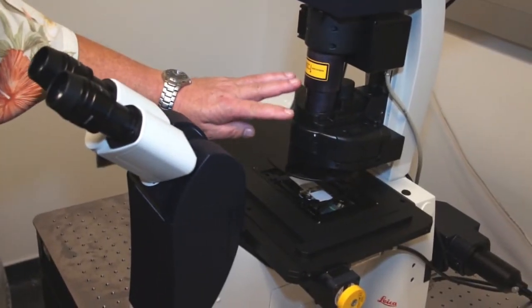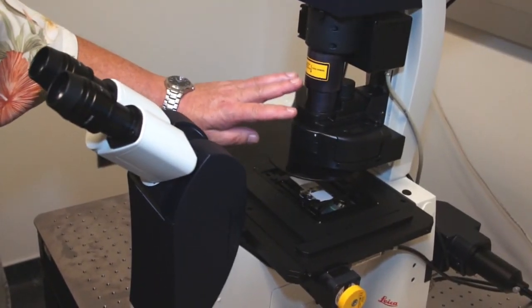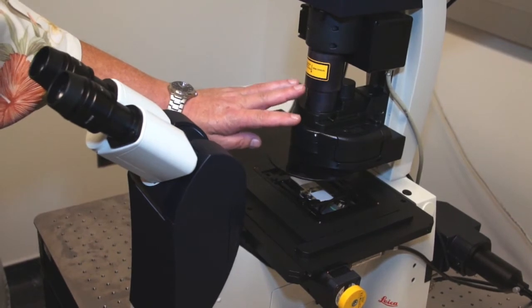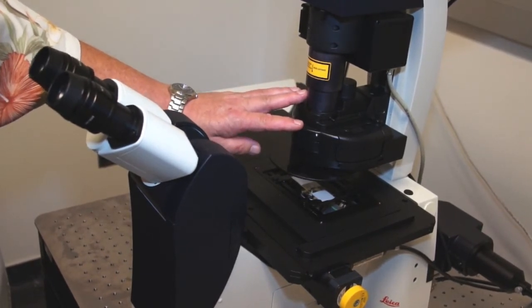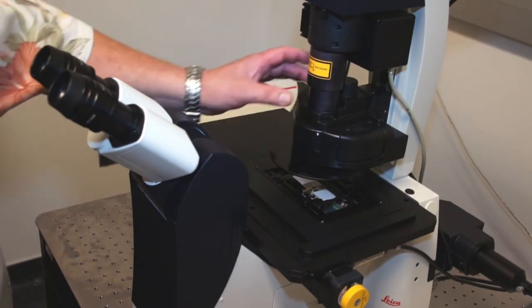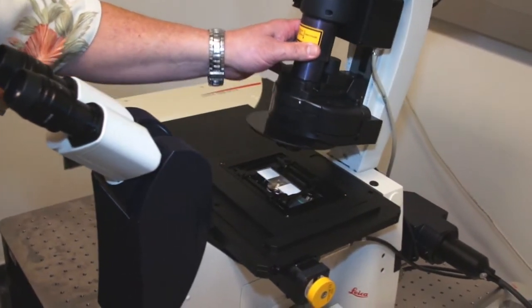As mentioned previously, we have a combination of wet objectives and dry objectives on the Leica Confocal Microscope. In order to go from a dry objective to a wet objective, we must first rock the condenser out of the way.